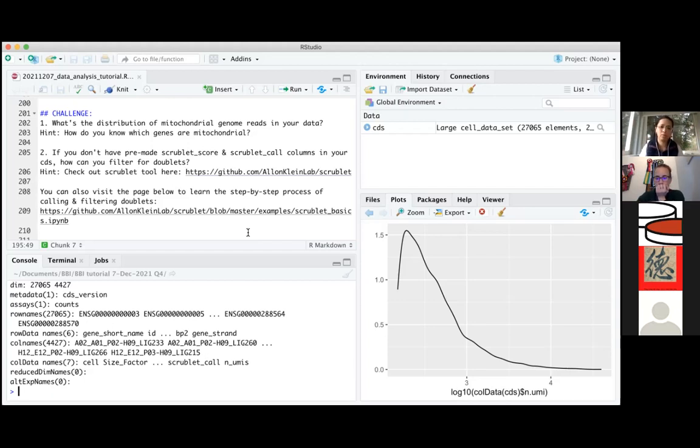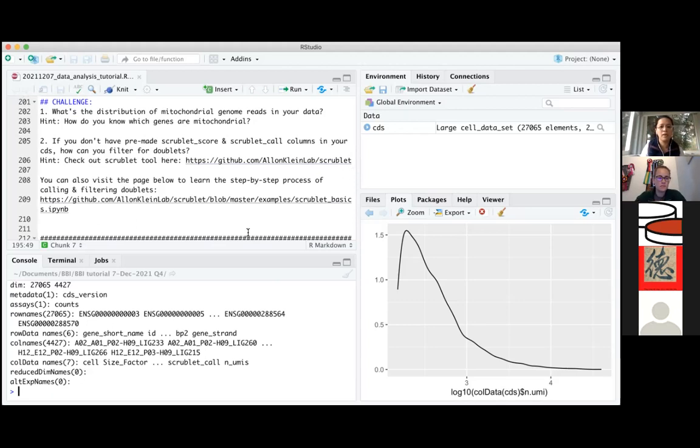And please come back with questions and I'll be super happy to help, because some of these early filtering steps are so important because sometimes after you do all of these filtering, you realize that in your data there's nothing in there. So instead of doing all the analysis and then realizing that it's not giving any meaningful result, it's good to first do a very solid filtering.